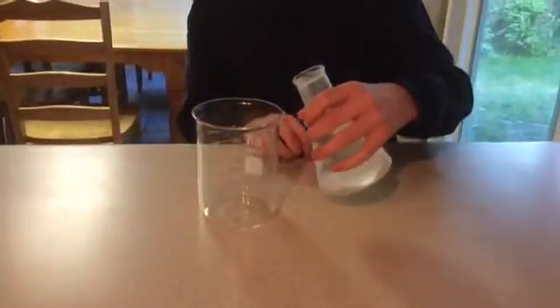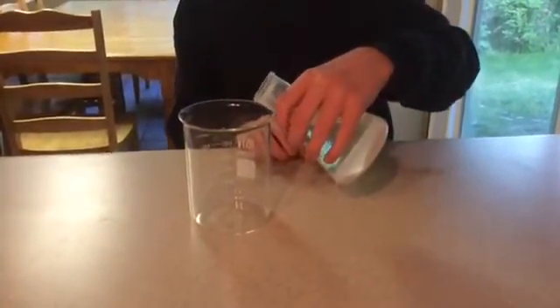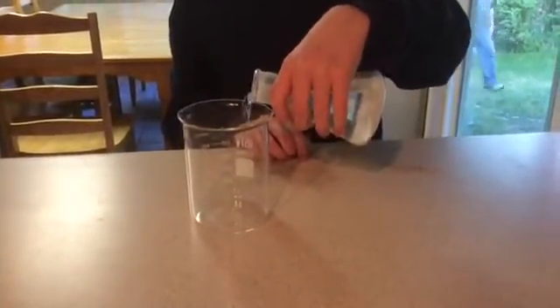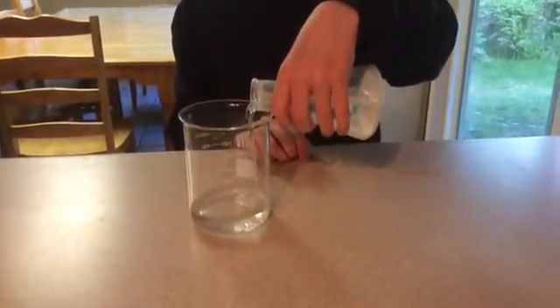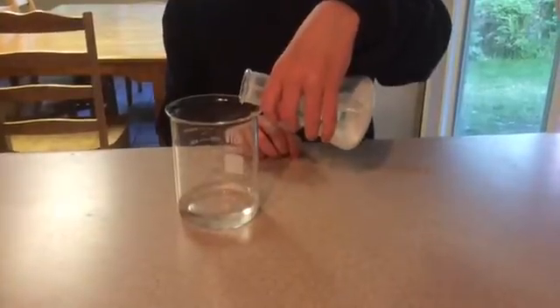And now he's going to pour off the clear part into the beaker and he'll leave the sediment behind in the flask. We want only the clear part. That is what is known as decanting.